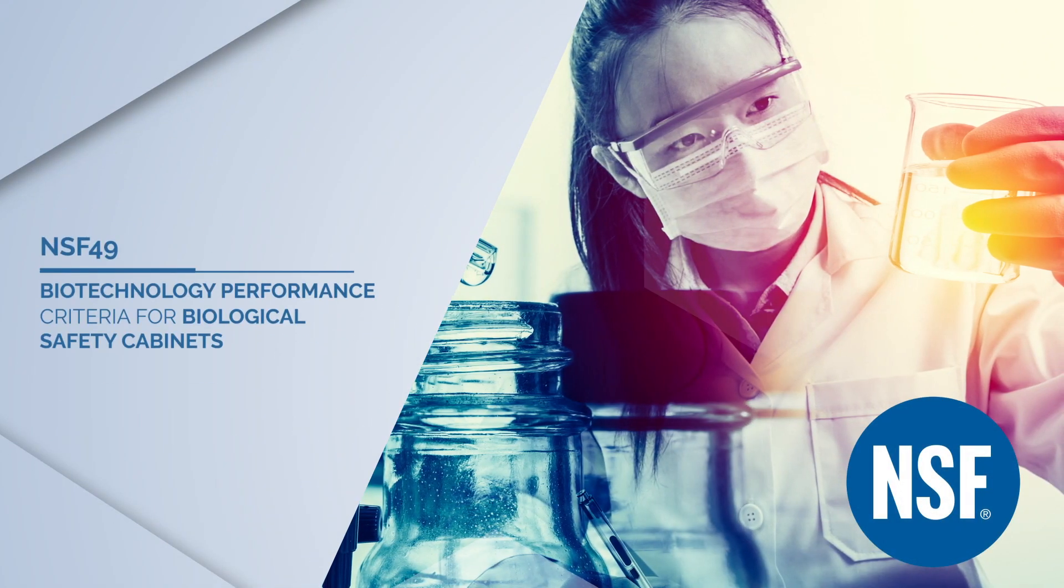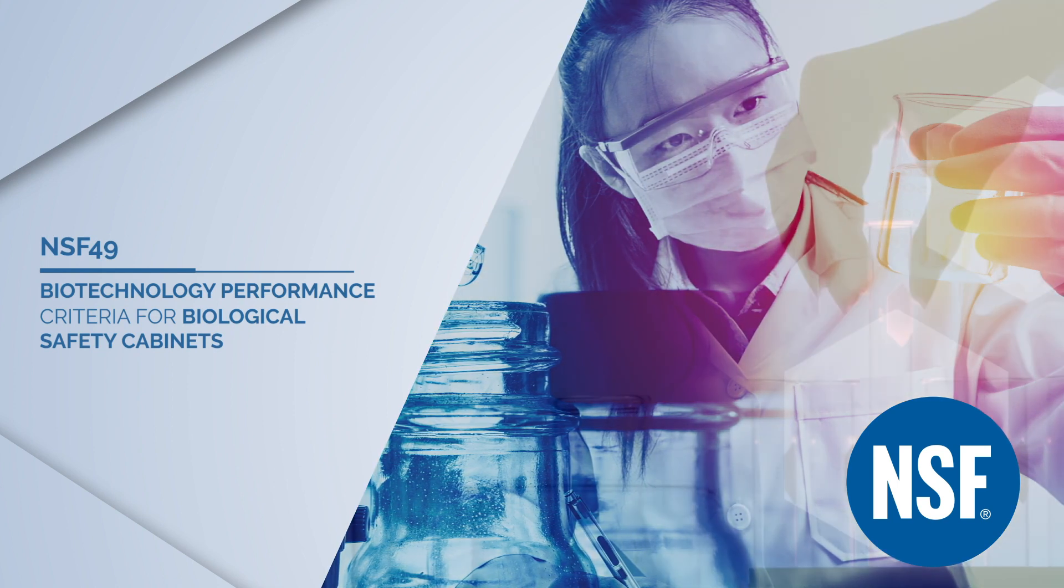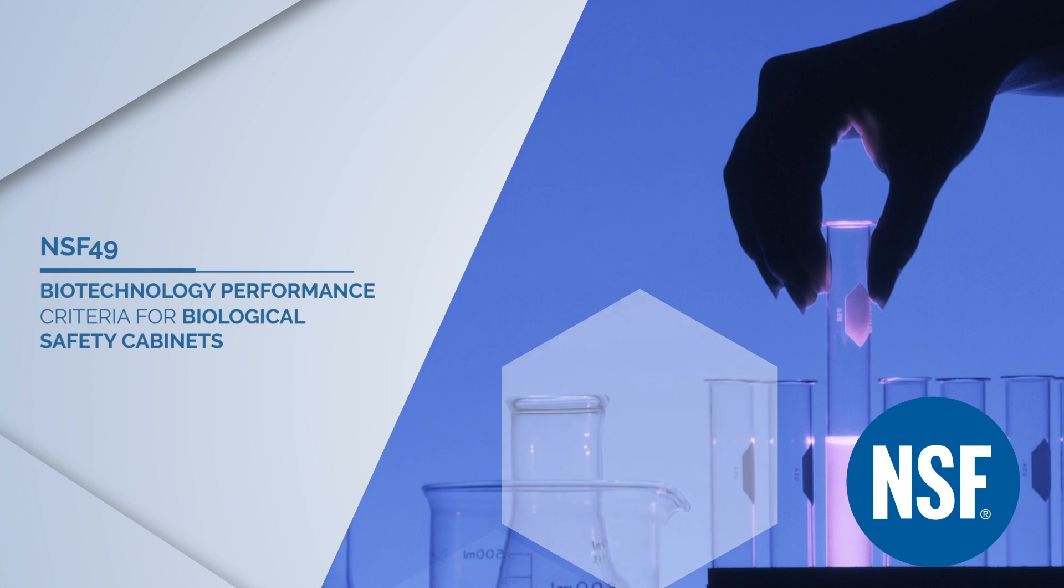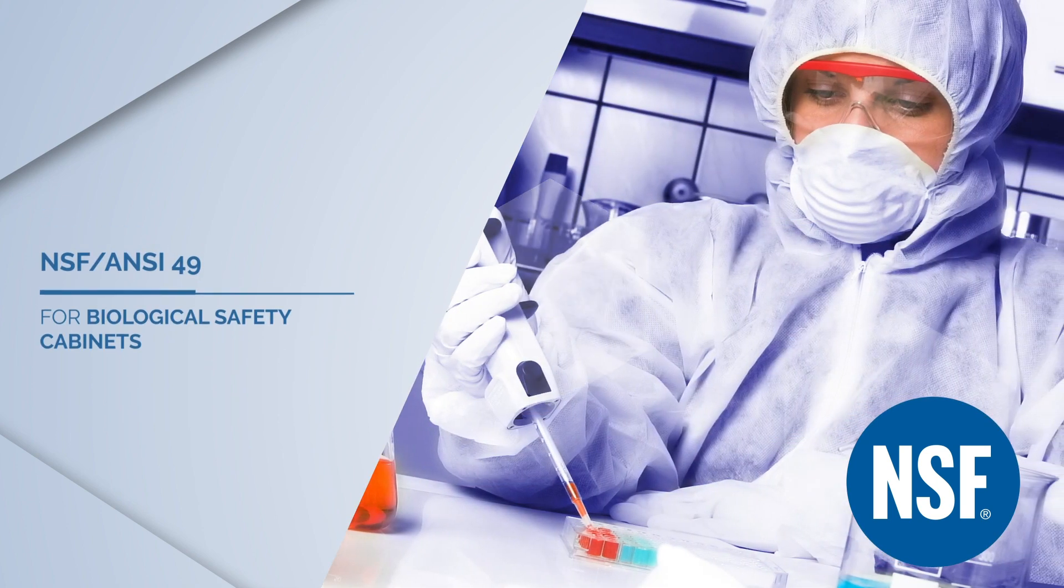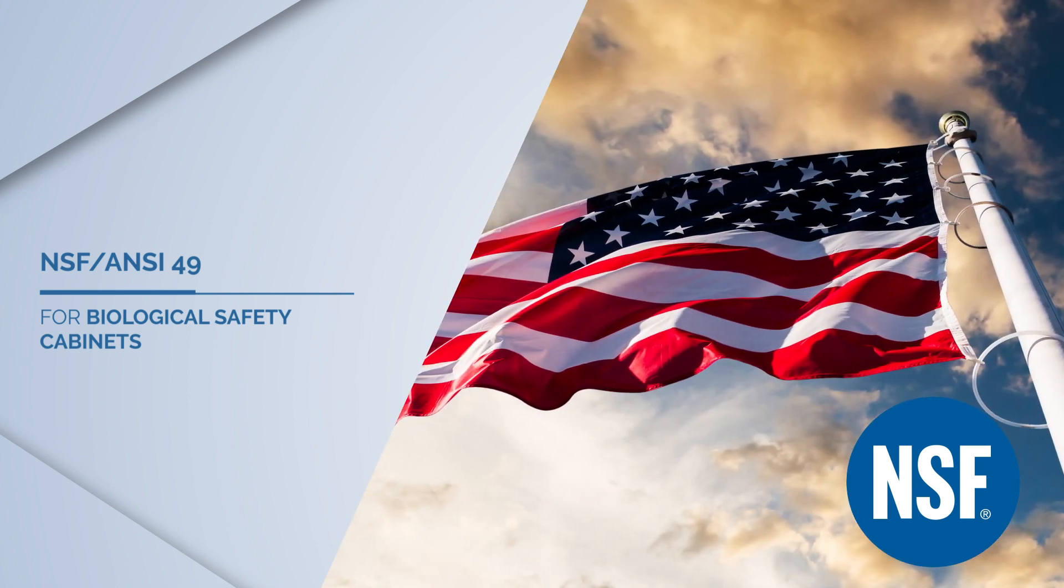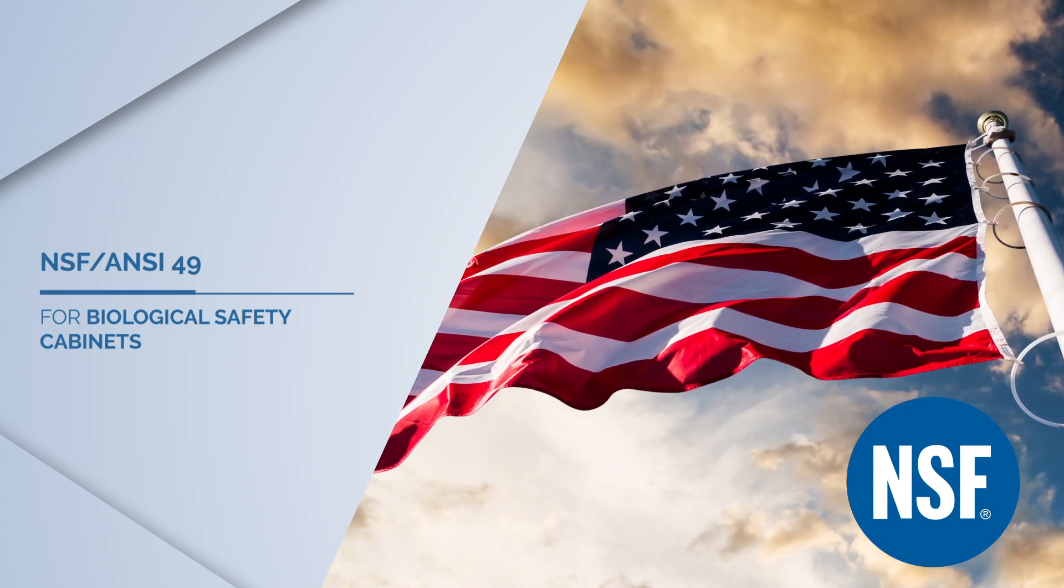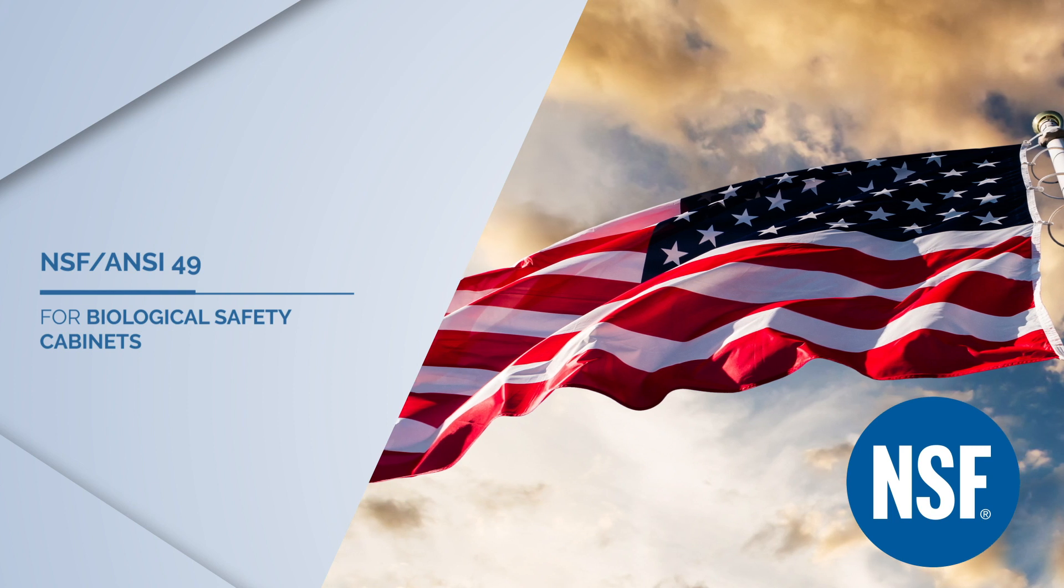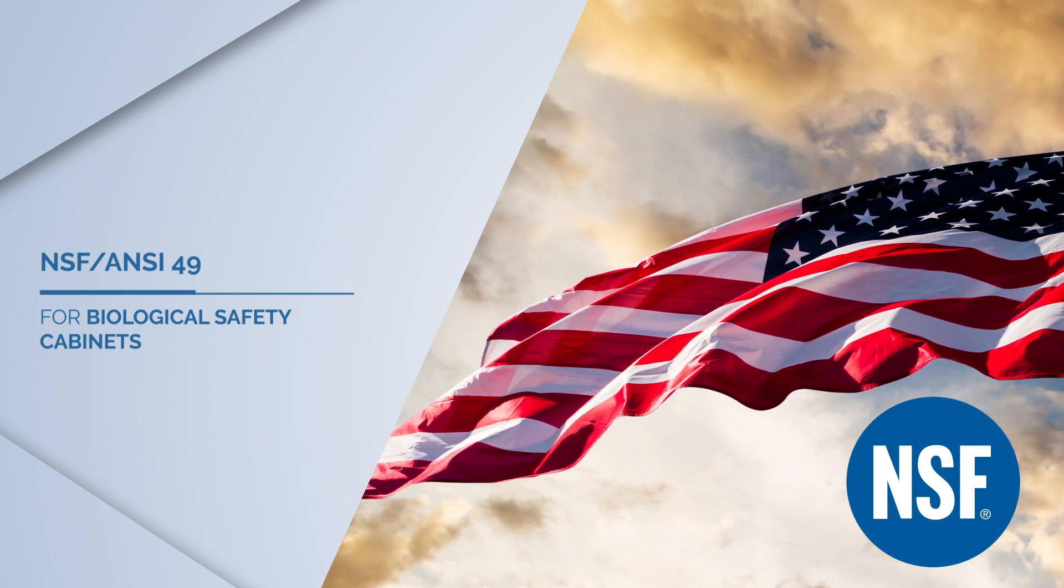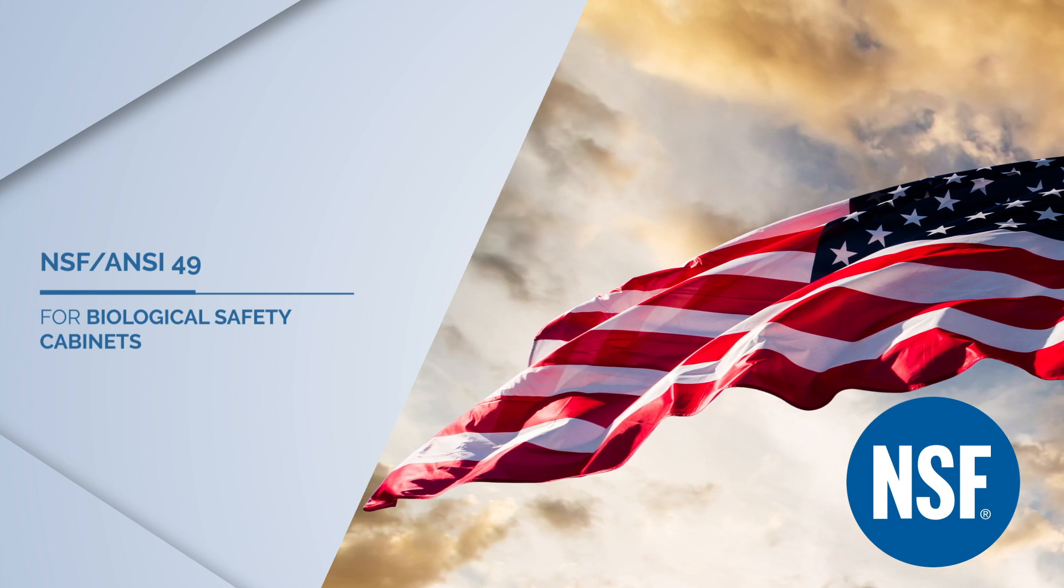Esco Biosafety Cabinet is certified to NSF 49. The NSF International Biological Safety Cabinet Program was initiated during the 1970s, and the NSF Certification Program was accredited by the American National Standards Institute and the Standards Council of Canada, and is recognized as the leader in the Certification of Class II Biological Safety Cabinets.